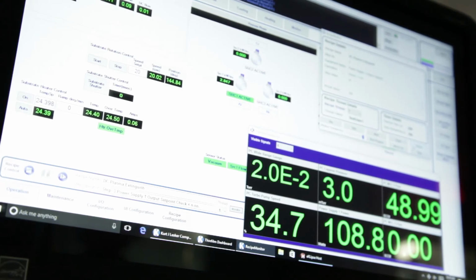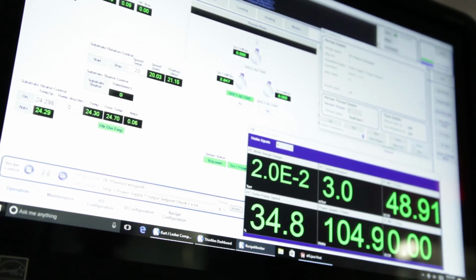In our system, the substrate sits on a tray at the bottom. The shutter opens and material begins depositing on the substrate. Our substrate tray can rotate to help even the coating and can be heated up to 500 degrees. The shutter closes again after a set time to end the deposition. Then the source shutter is closed and the plasma extinguished. All of these steps can be initiated in the software or programmed into a recipe that a user can execute with just the push of a button.